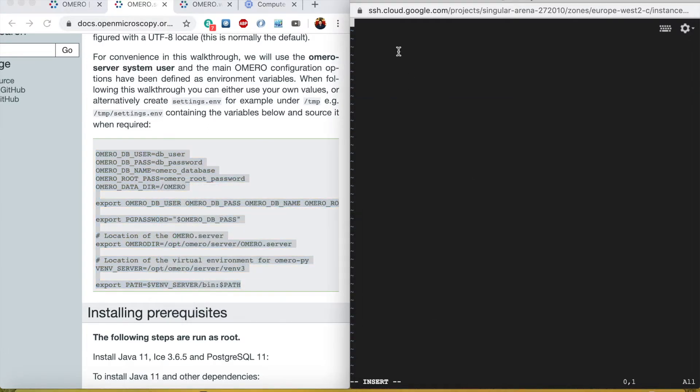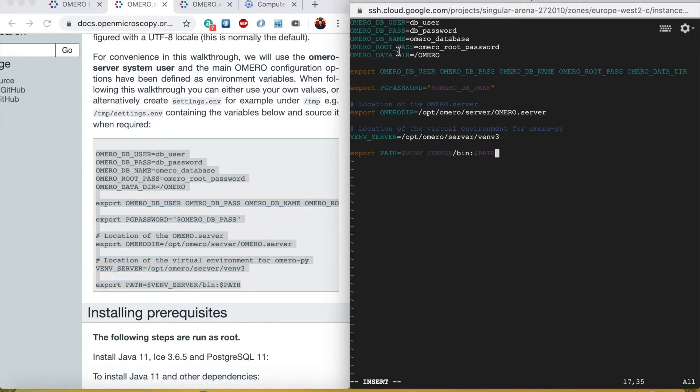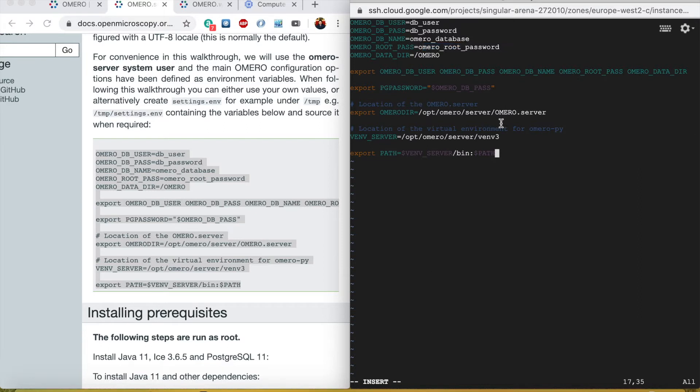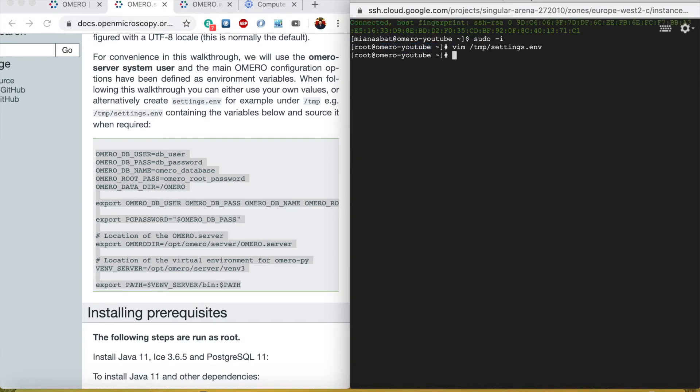From their website, if you want you can change the user. For production version you will definitely change the DB user and DB password and similarly this, but I will keep the same for simplicity. I will save the changes.